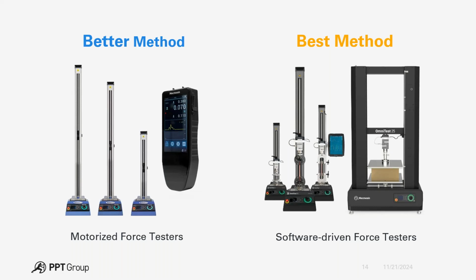So in that case, your best method is your software-driven tester, where each test is configured specifically to the sample that's being tested, in cases of whether you're measuring displacement, whether you're measuring top load, whether you're measuring both. You'll have each test uniquely configured. So all the operator has to do essentially is just call up the test, put a bottle or sample in, and hit the start button. The rest is all taken care of.